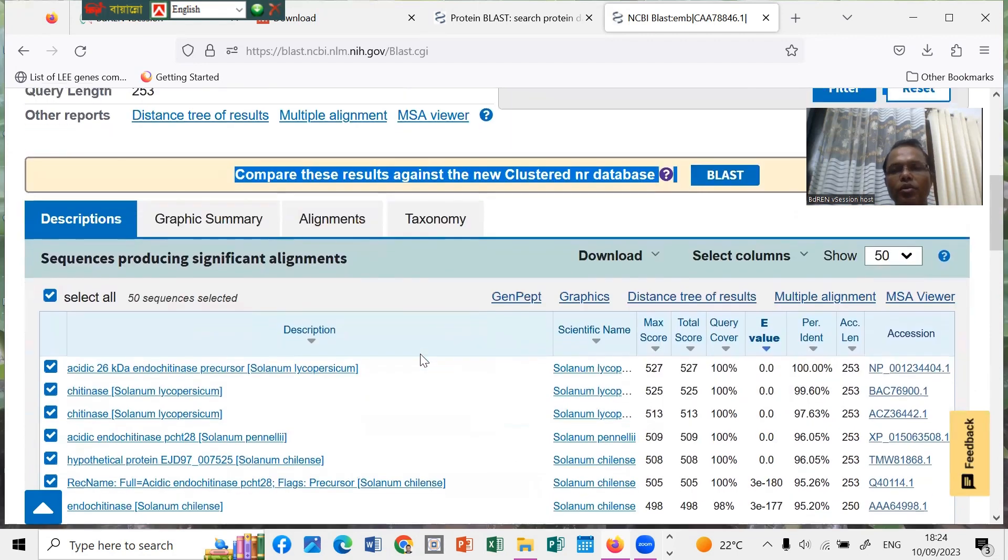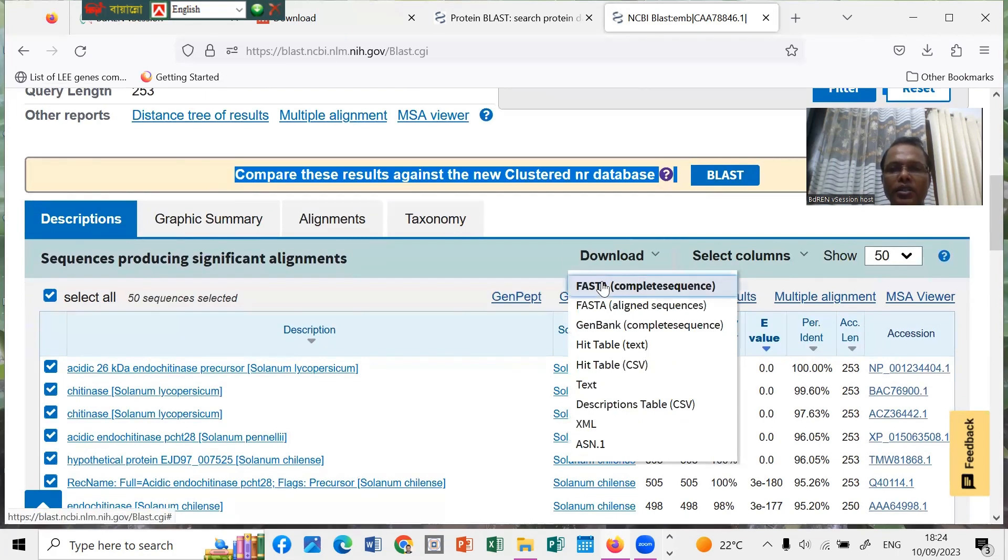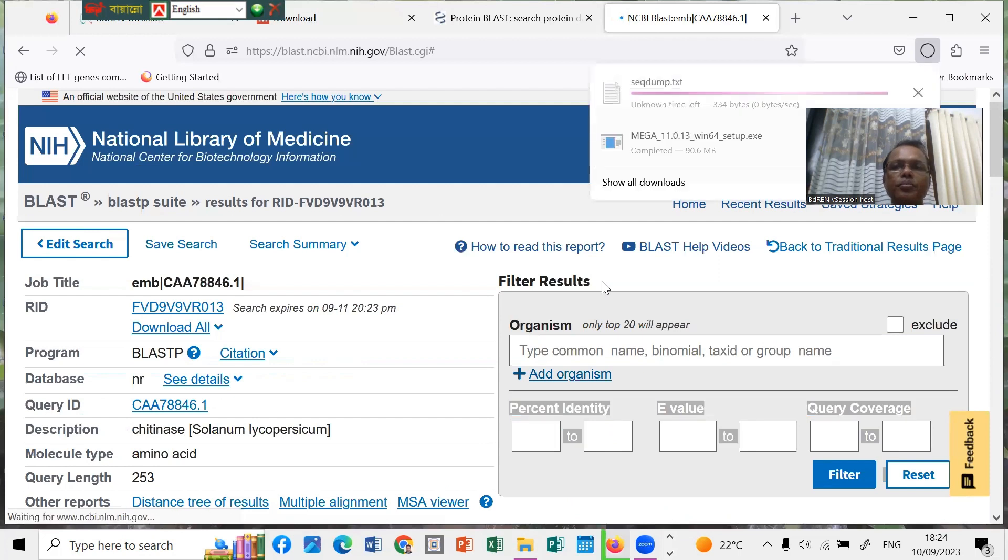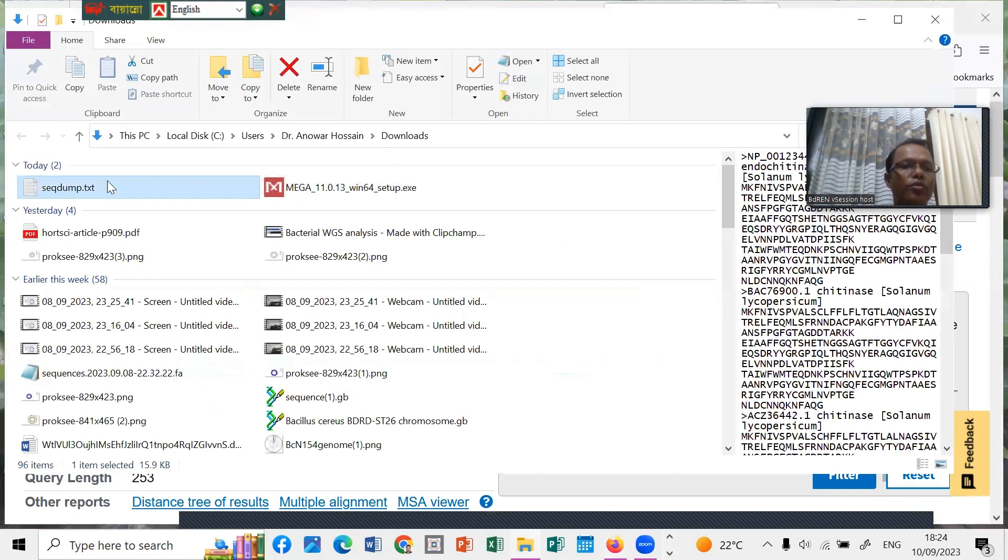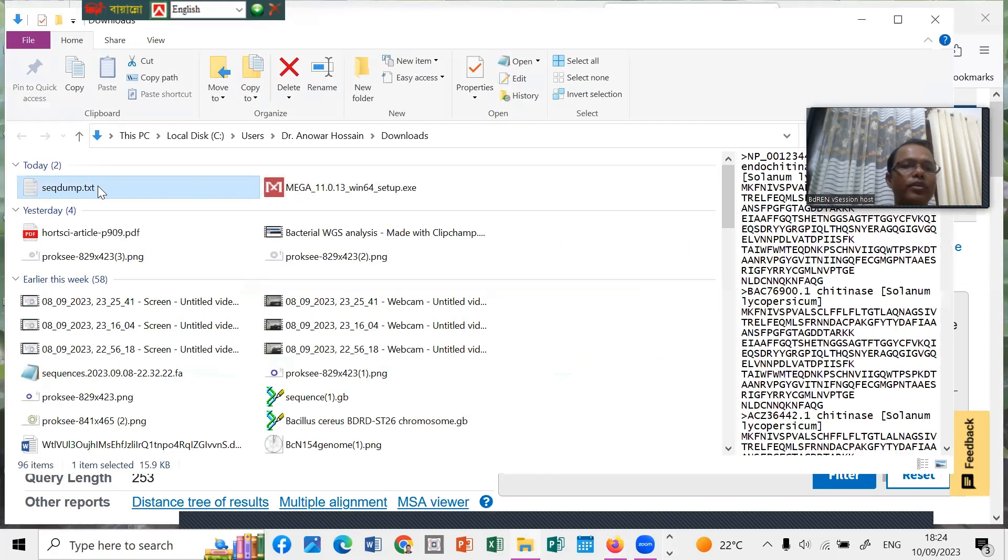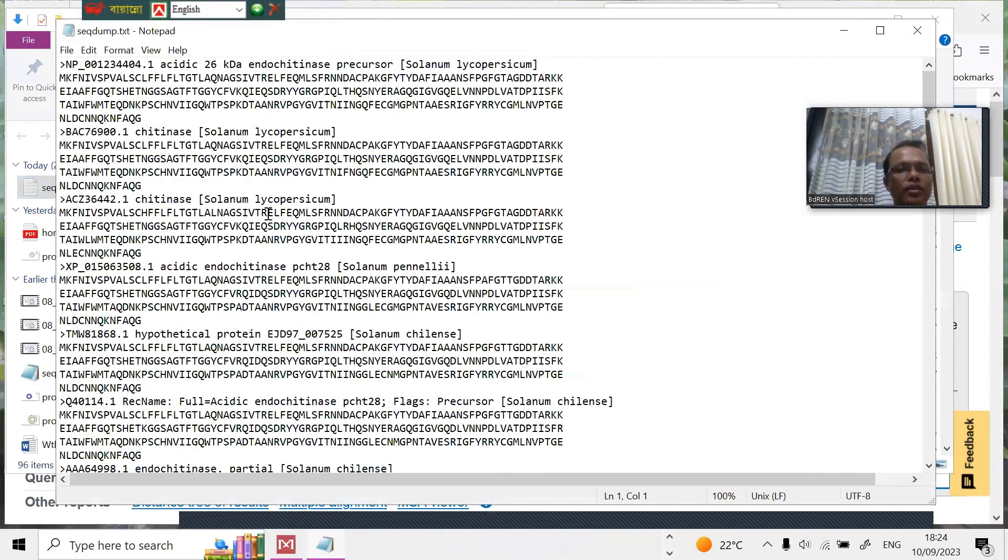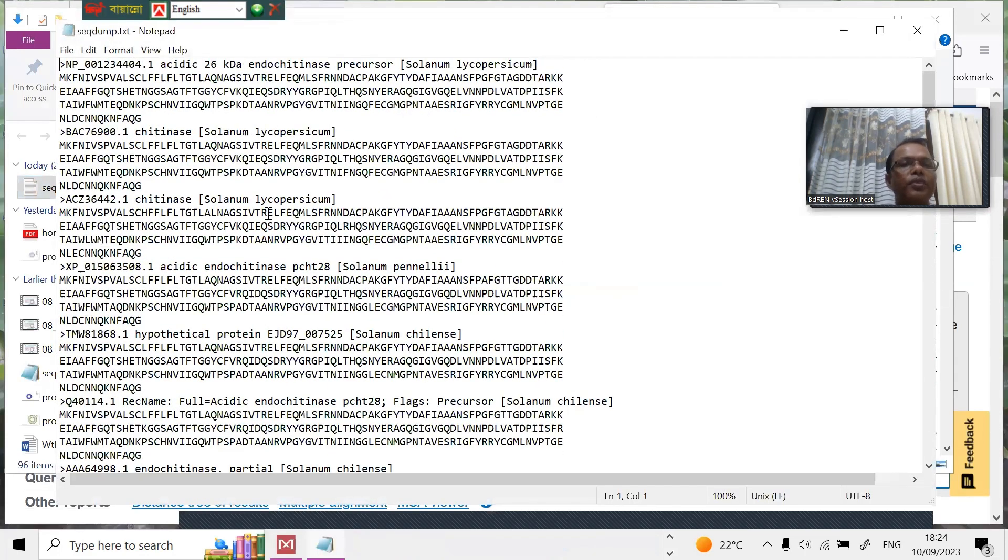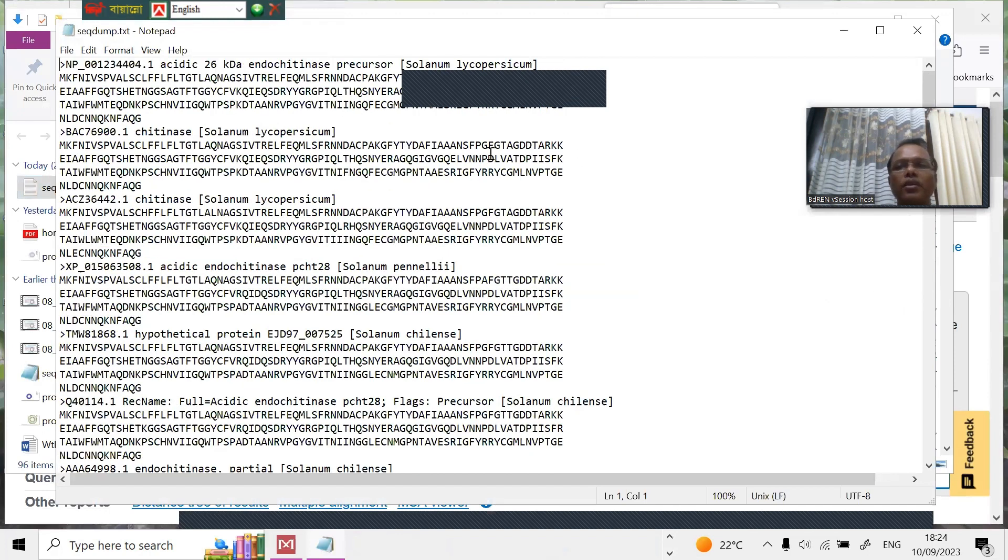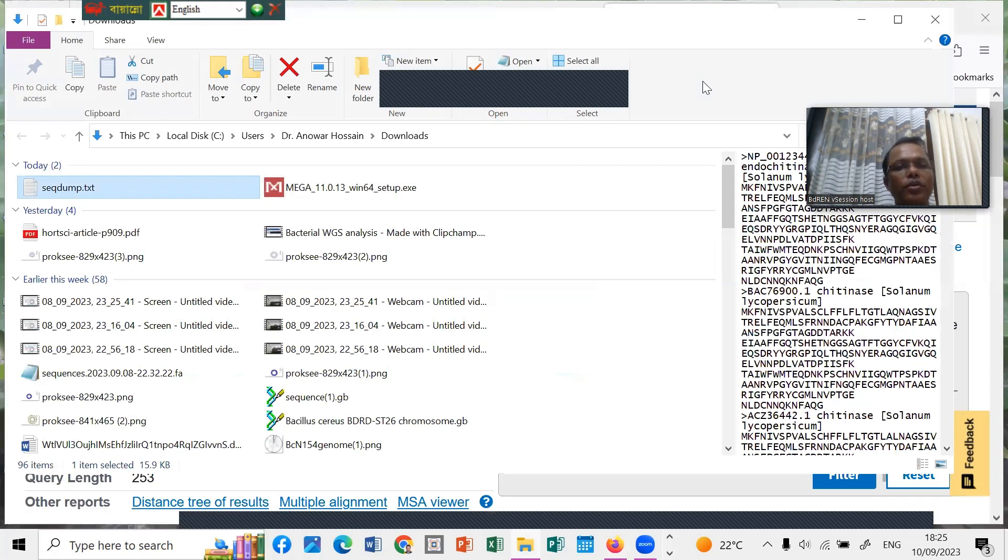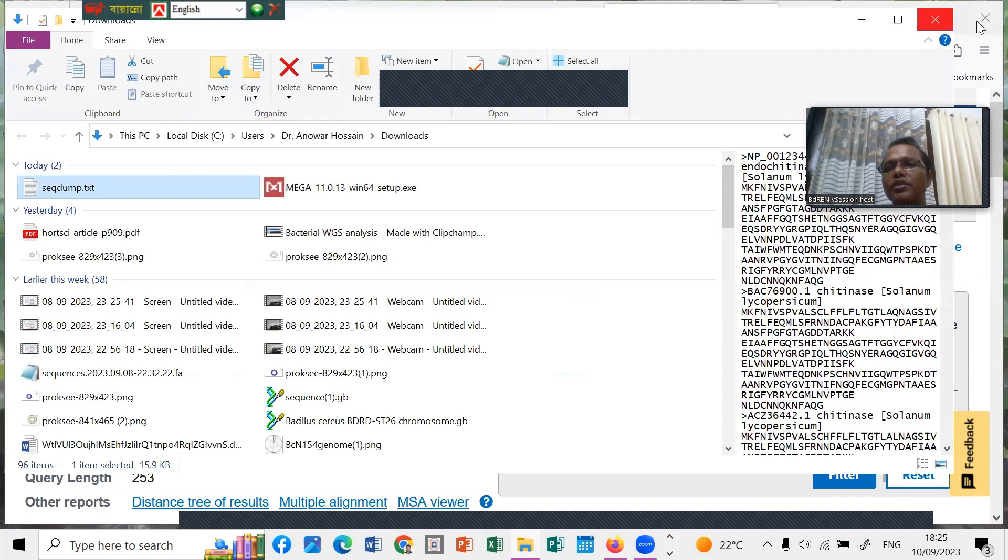From here we can download the sequence of the 50. We can download the FASTA sequence. This is the FASTA format. Now open this one, you see the FASTA format, all the 50 sequences here. Later we can close it, and then we have to edit the names because the name is very big, so we have to shorten the name. I already made this type of work, so let's start our phylogenetic tree construction.